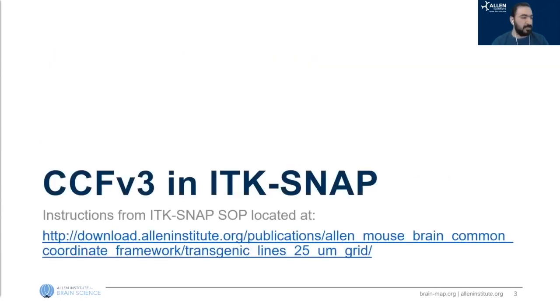So the CCF through ITK-Snap, you can get the instructions for how to operate ITK-Snap for CCF purposes through this link here. There's a Word document that has all of these instructions, but I'm going to go over them in the next slides.